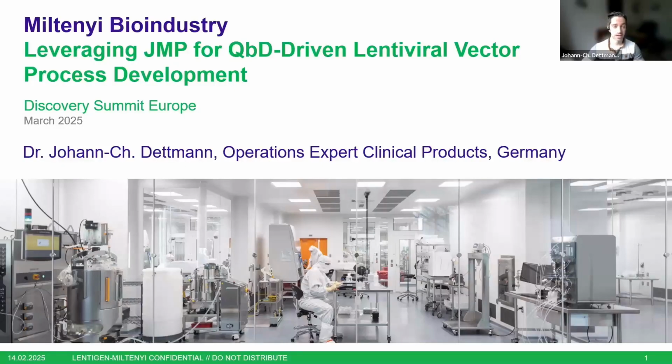In my presentation today, I will also complement the established data analysis strategy by introducing some alternative additional insights, which are, from my perspective, quite helpful. The presentation will be split into two parts. In the first part, I will give a general introduction into the topic, and afterwards, I will give a little demo of how we use JMP to evaluate DOEs.